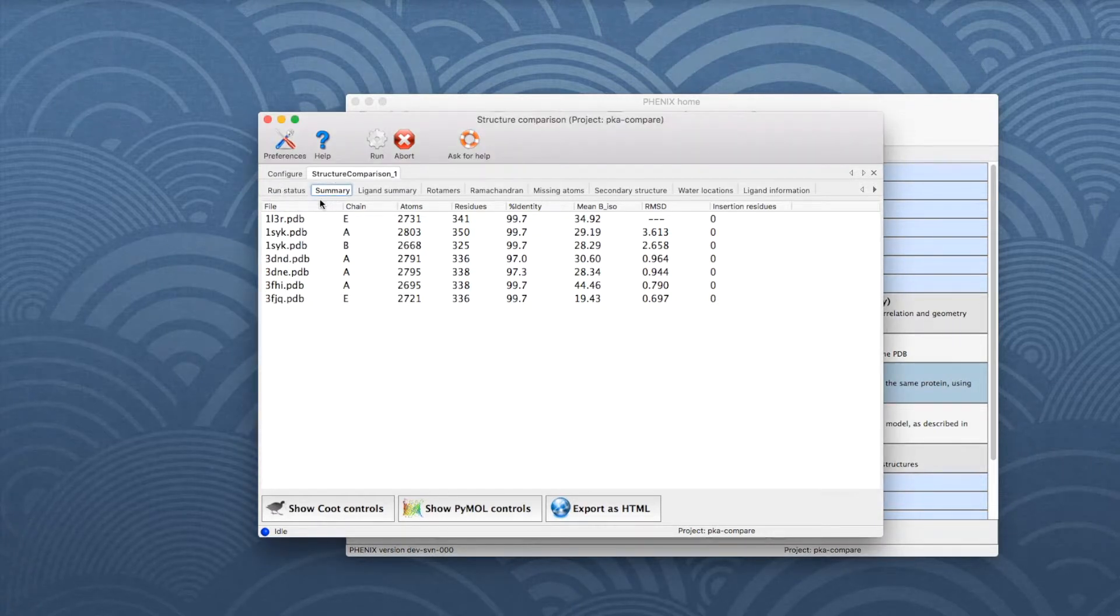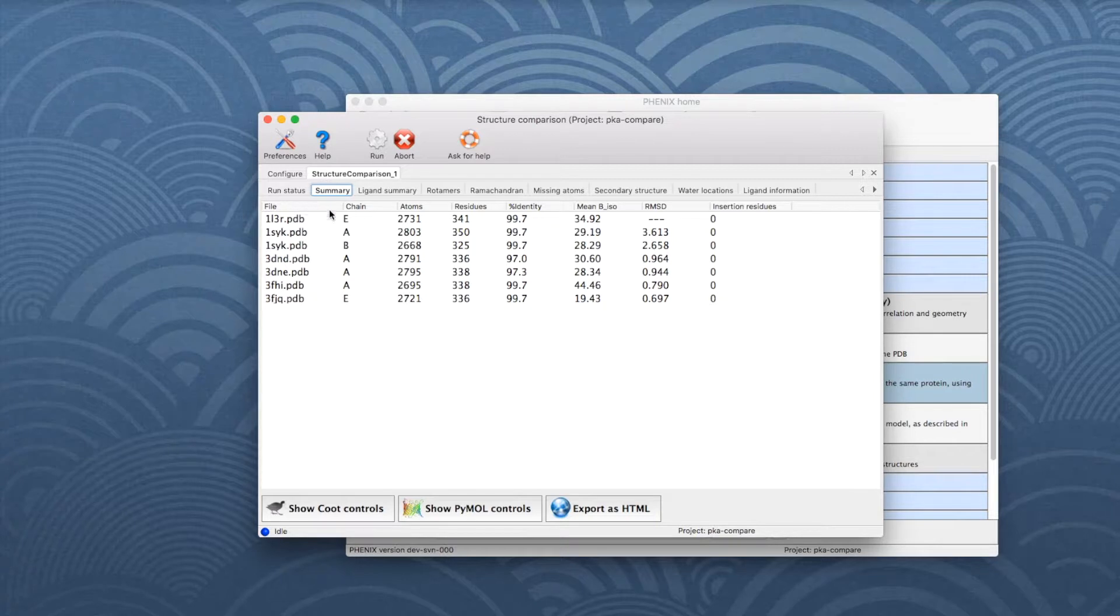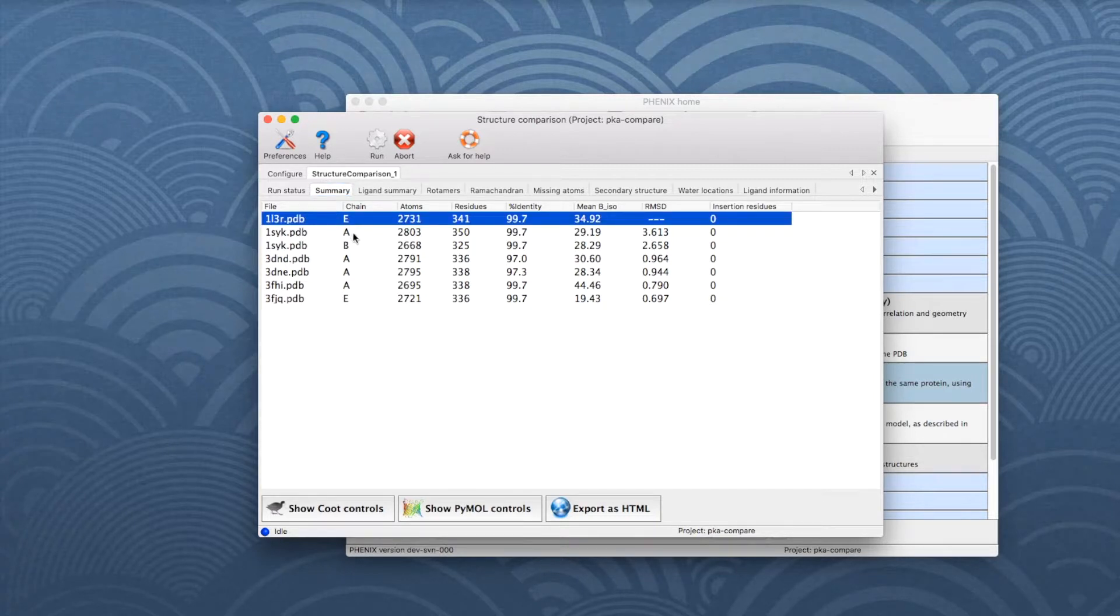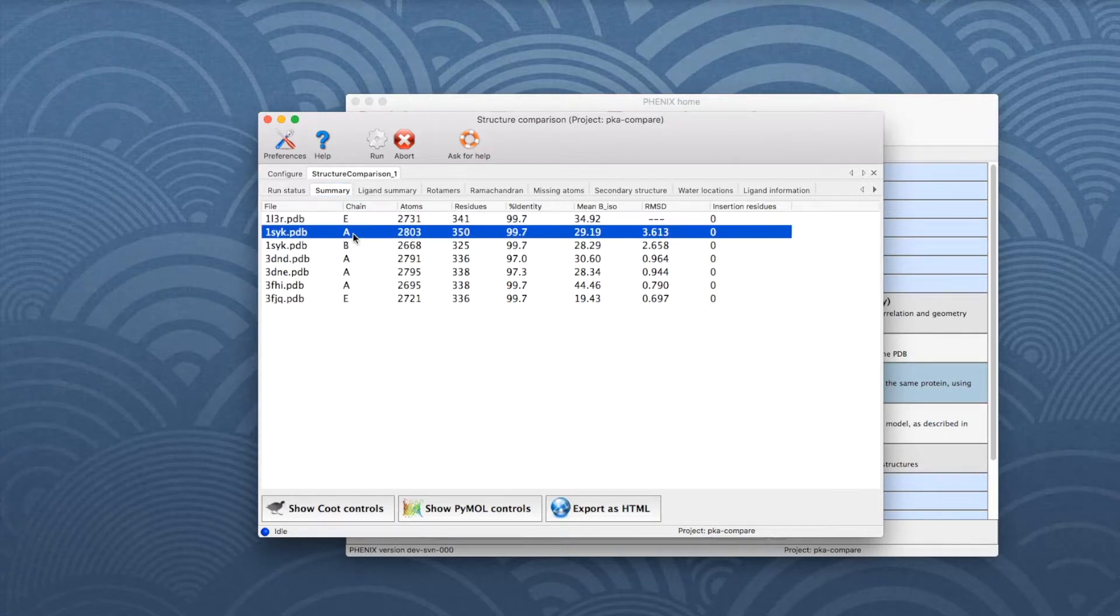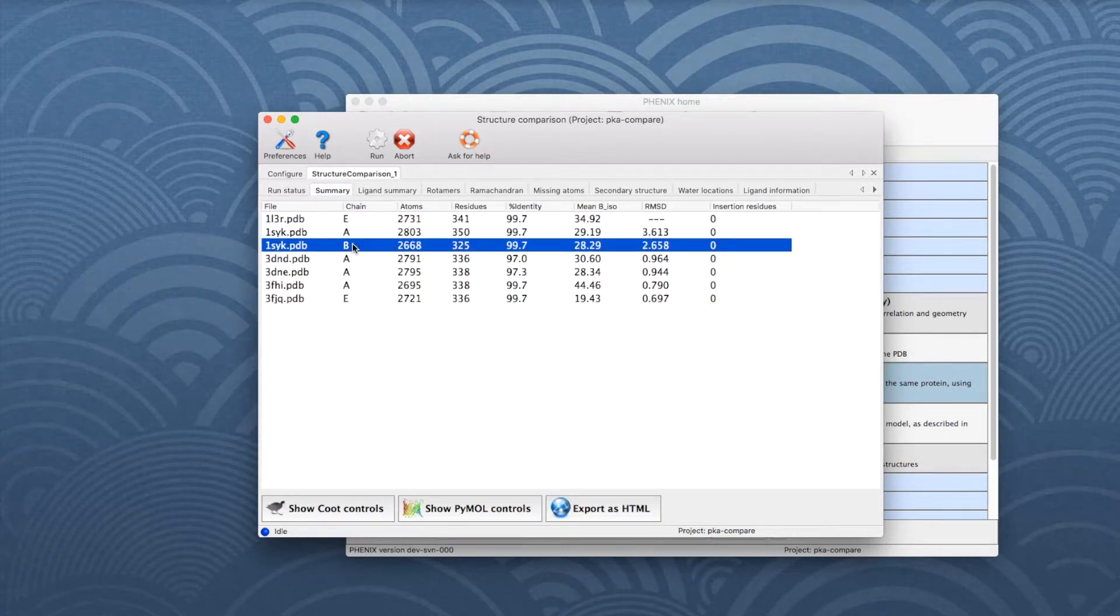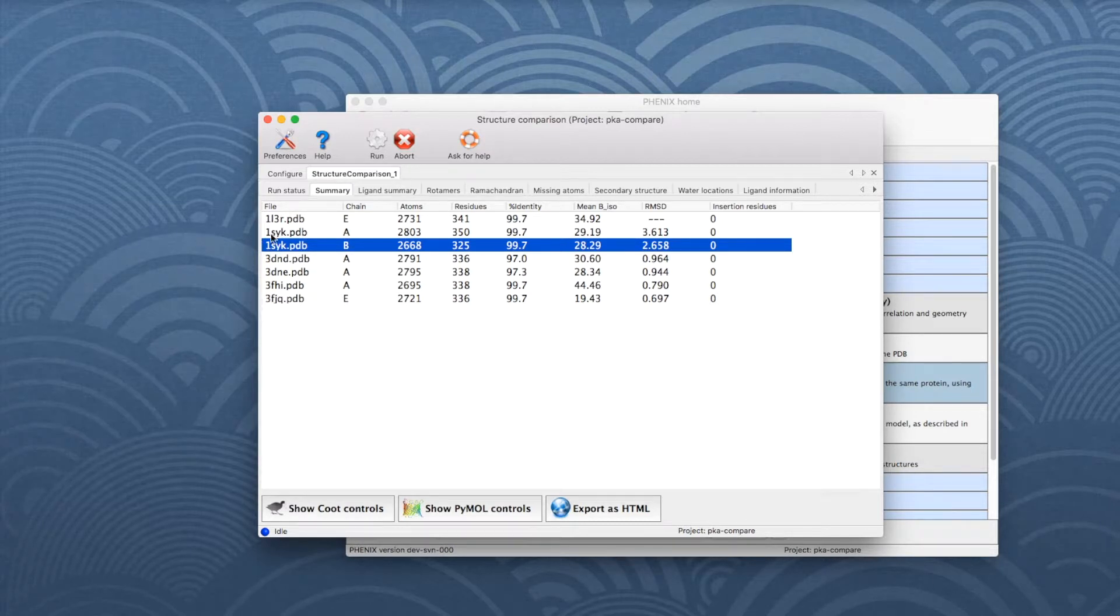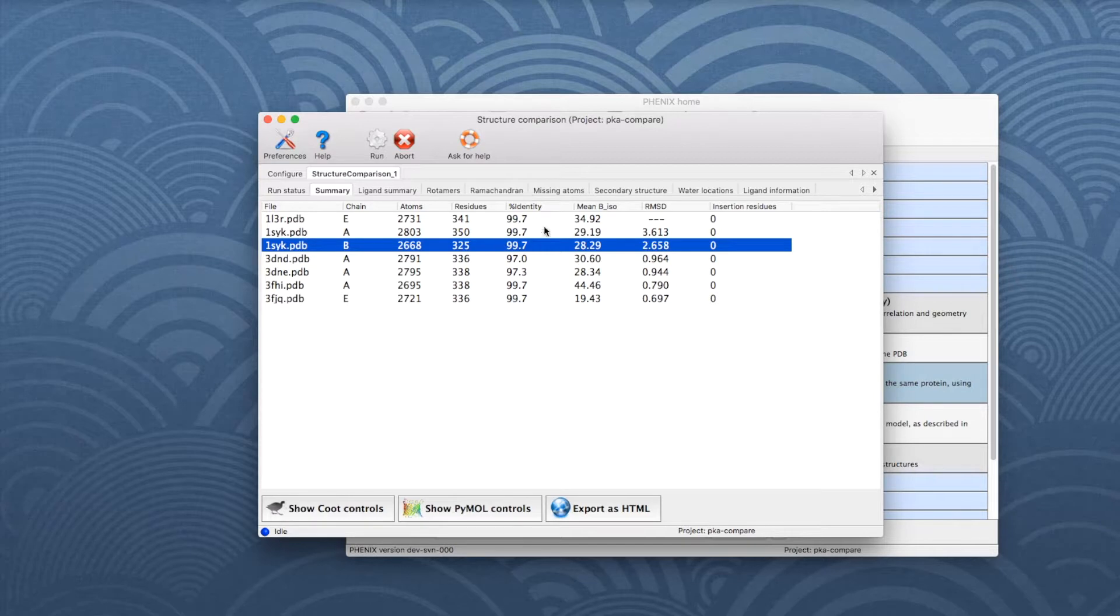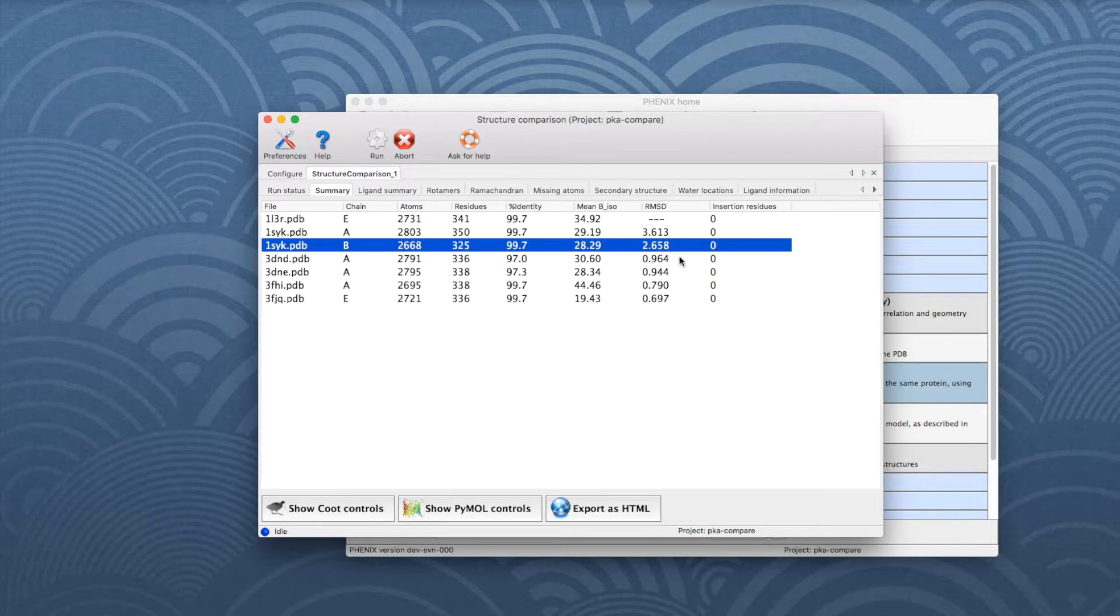In the left column is a list of the chains matching the reference. For example, chain E of model 1L3R matches chain A and B of model 1SYK. The table then lists the number of atoms and residues, the sequence identity in percent, the average isotropic B factor, and the RMSD if superposition was enabled.